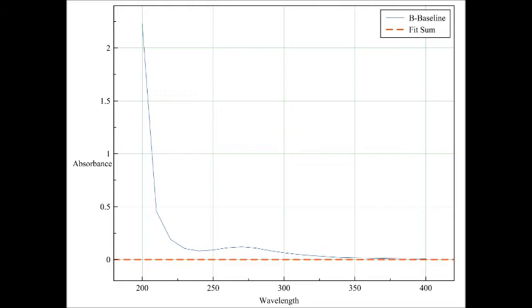I think the graph would look a little bit different had I used a logarithmic scale. I think the peaks would stand out more. However, for a first time, this is a pretty good result.